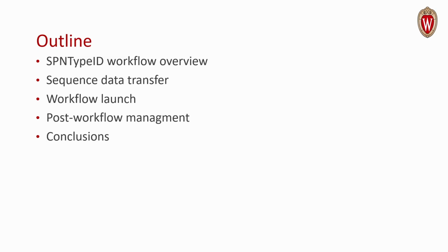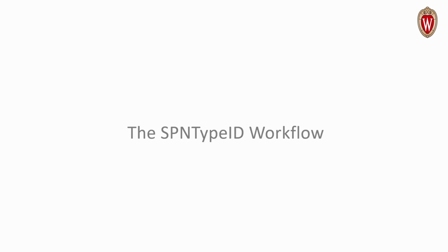Now, here's an outline. First, I'm going to give you an overview of the workflow. I'm going to be talking about how sequence data is transferred, the actual launching of the workflow, post-workflow management steps, and of course, conclusions.